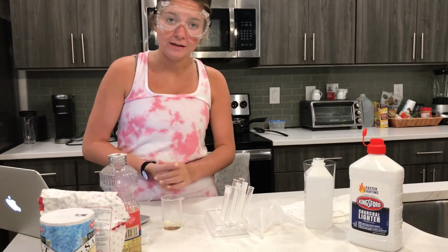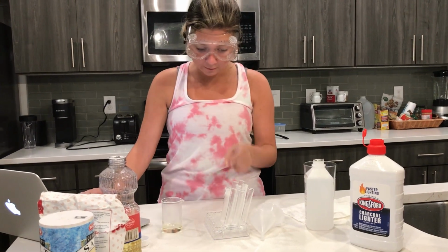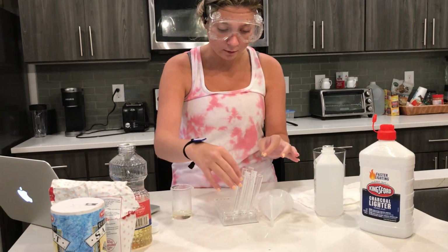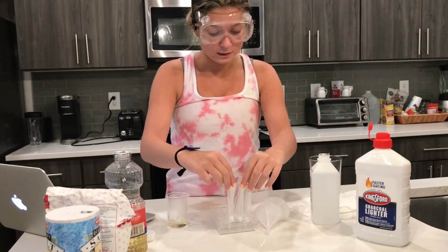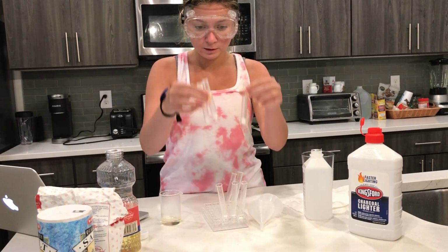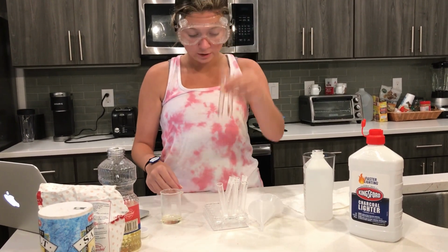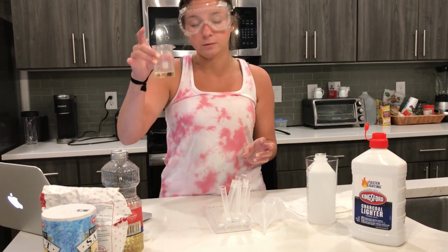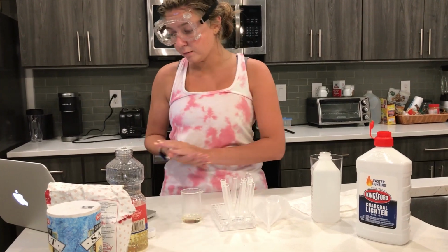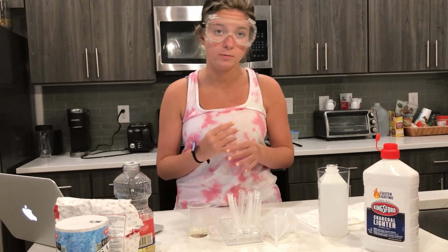Hi, so today I'm going to be doing lab number 3 and I'm going to be performing data table number 1. So for this lab we have 3 solutes: salt, sugar, and oil. I've already pre-poured 3 test tubes with salt, and then I have these 3 with sugar, and then I'm going to use these 2 with oil, and then I'm also going to be using this little beaker with oil because I don't have a 9th test tube. And so all of my solutes are already poured, and so I'm going to be adding solvents to these to test their solubility.